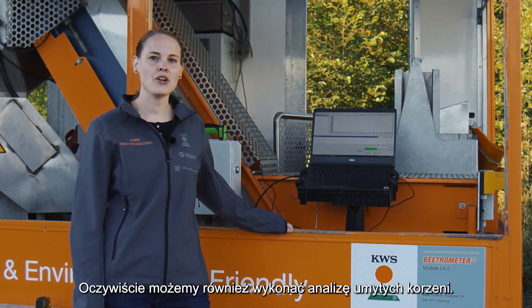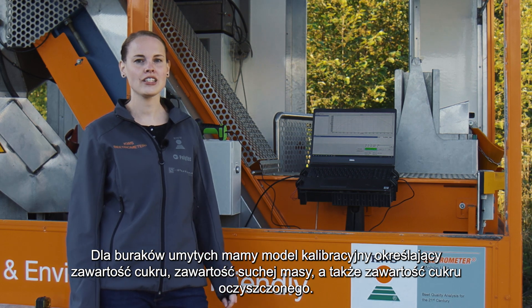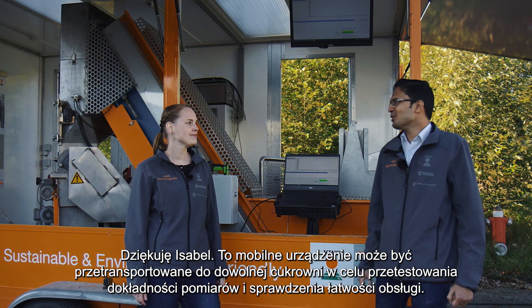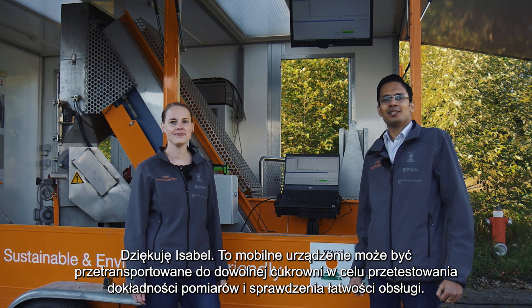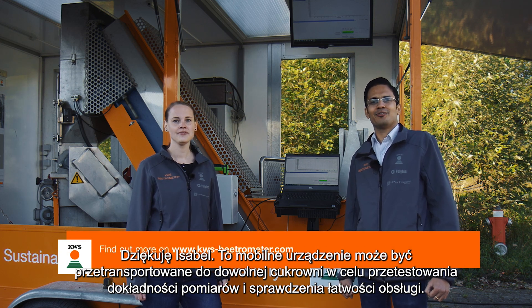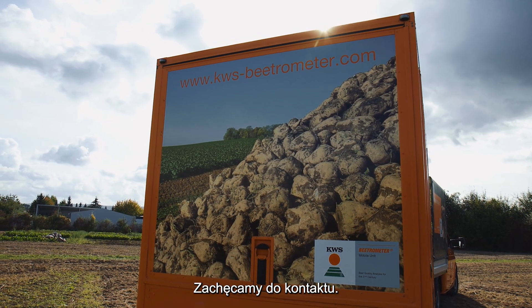Of course, we can also measure washed beets. For washed beets, we have calibrations for polarization, dry matter content, and also recoverable sugar. Thank you, Isabel. This KWS Beatrometer mobile unit can be transported to any sugar factory to test for the accuracy of results and ease of operation. Please feel free to contact us for further information.